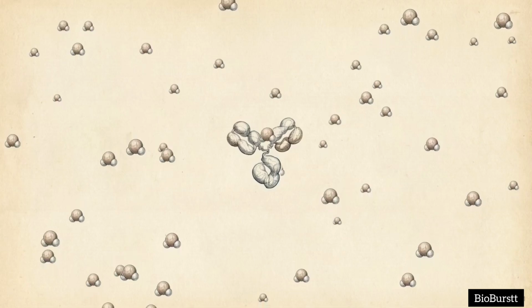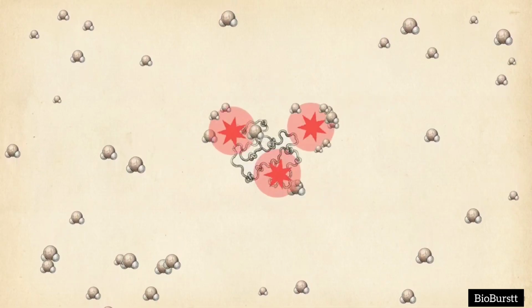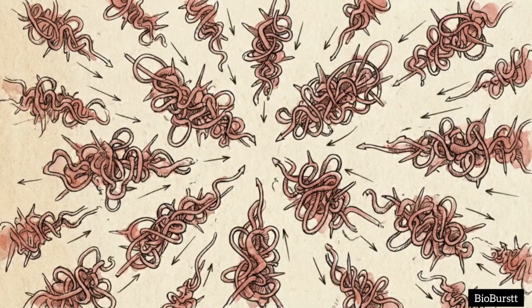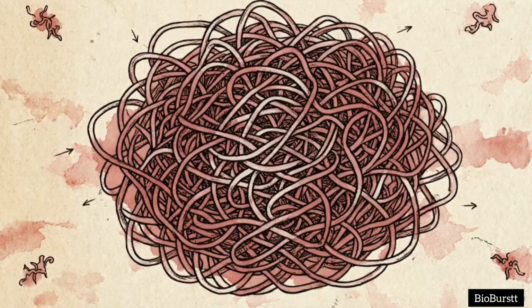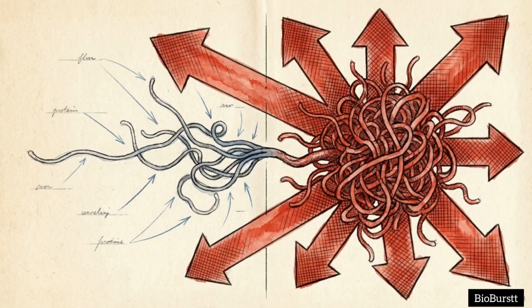When a protein denatures, its interior hydrophobic regions are suddenly exposed to the surrounding aqueous buffer. To shield those hydrophobic regions from the water, adjacent protein molecules rapidly clump together in an uncontrolled reaction called aggregation. Aggregation is a massive exothermic event. It releases heat, which actively cancels out the endothermic absorption signal required to measure the protein's initial unfolding.